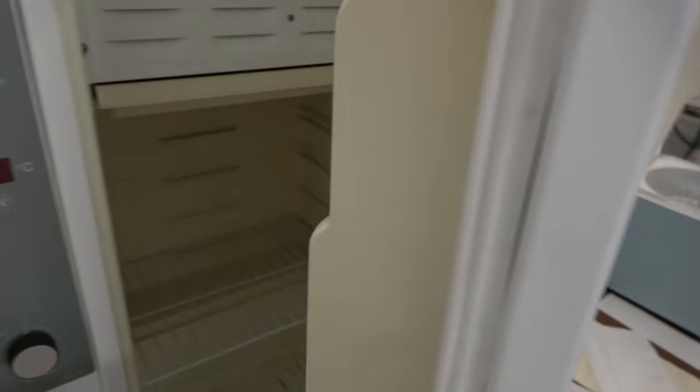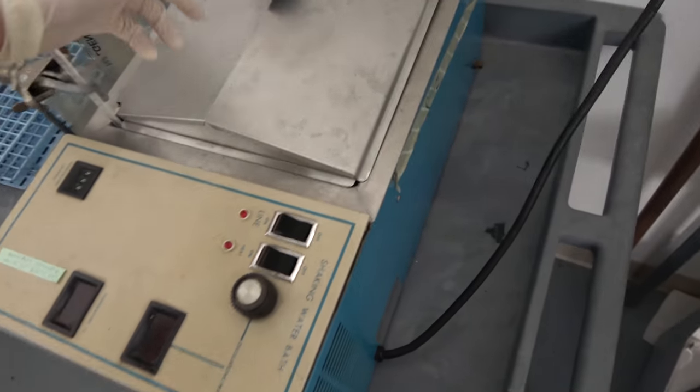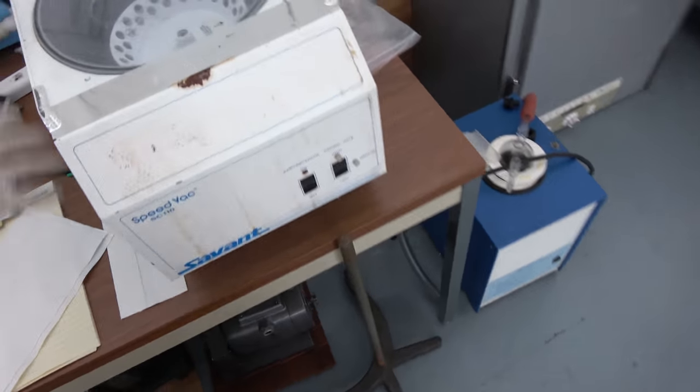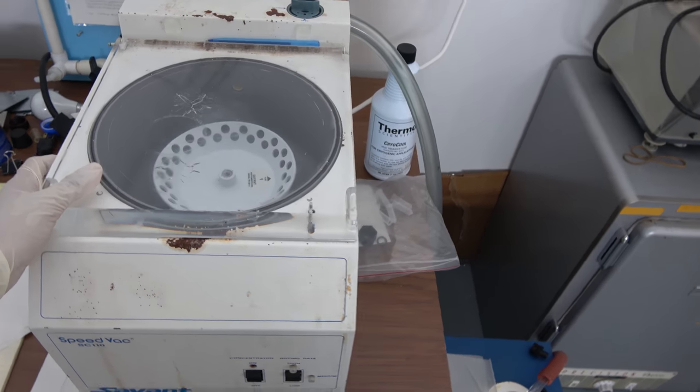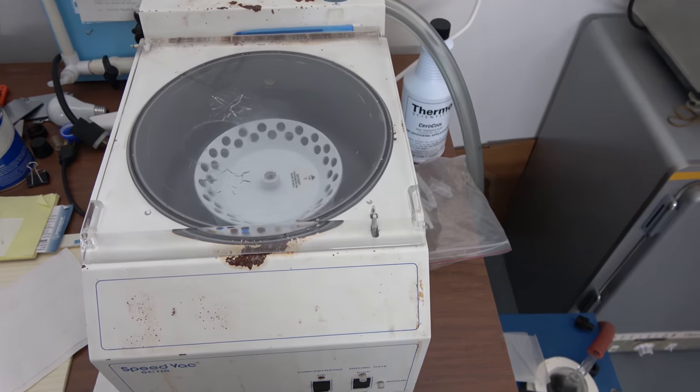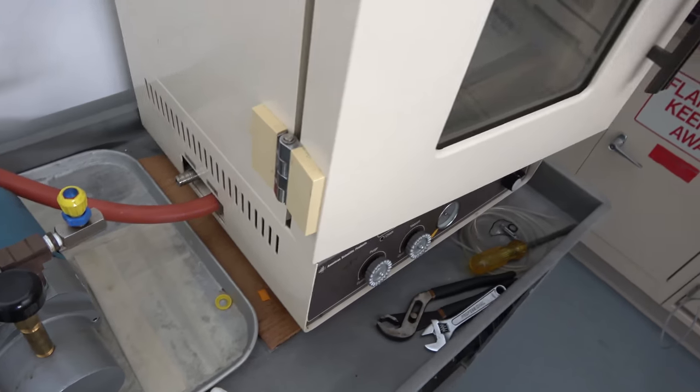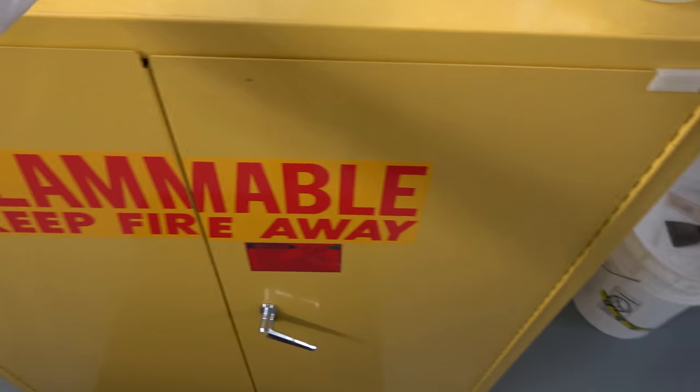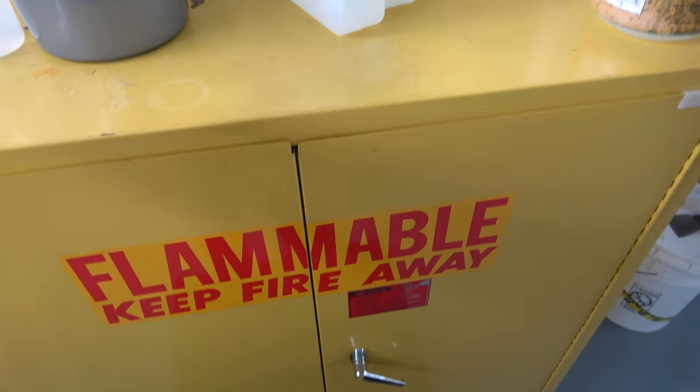This is an incubator. If you want to keep for example some bacteria growing still you put it in here in the petri dishes. Here's a water bath. Put the test tubes or whatever in there if it needs to be in a water bath. Here is a speed vac. This isn't just a centrifuge. This is a centrifuge that is also a vacuum. Now why would you need to do that? Well sometimes you need to concentrate some samples in these little tubes and it'll draw out some moisture and then concentrate the solution. A vacuum oven and here's a vacuum pump that makes the vacuum or the vacuum oven. Important to note all kinds of alcohol, all kinds of flammable material should go in its own flammable cabinet. Keep it all together in one place so that if one thing blows up they all blow up.